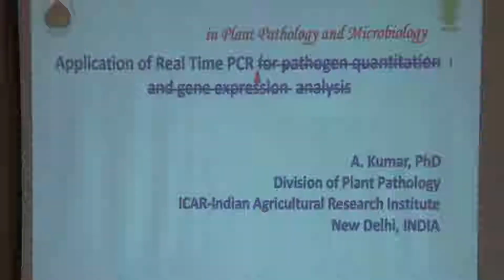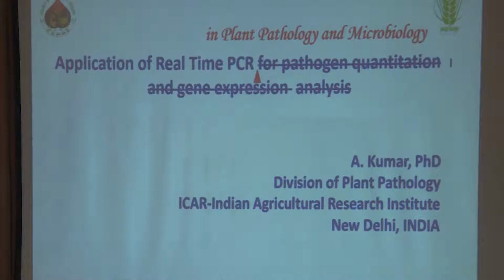Okay. I'll take you on a small tour of the genesis of this real-time PCR technique. It's very, very interesting. So this real-time PCR tool is a relatively new tool, started evolving after 1990.